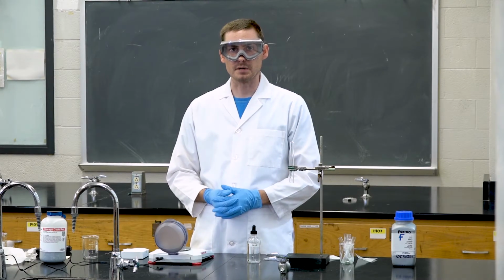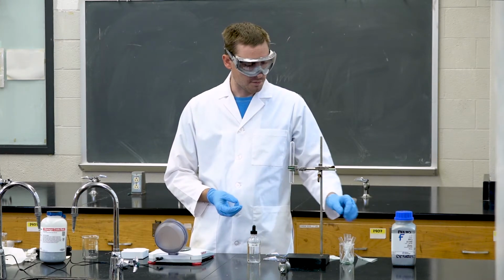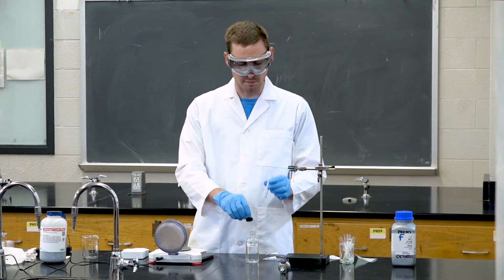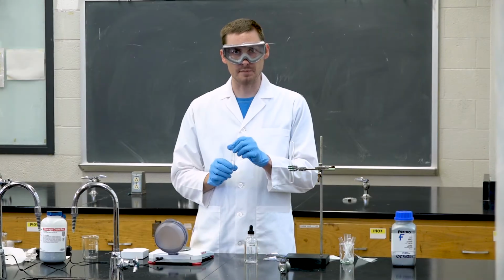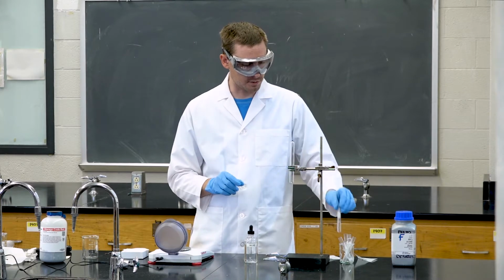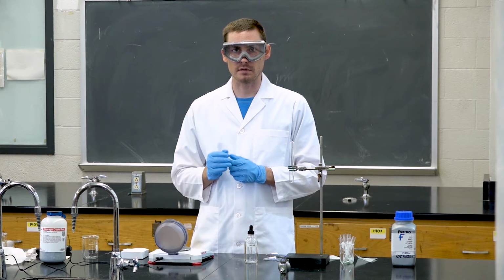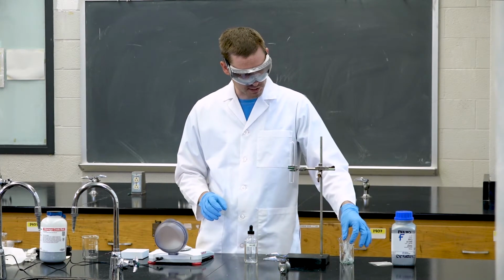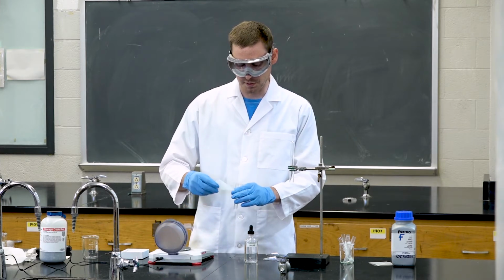So after we perform the experiment with zinc, we're going to repeat the experiment with calcium, but we're going to use less calcium this time. First, we want to add 5 milliliters of 6 molar hydrochloric acid to a test tube again. After we have measured out the hydrochloric acid into a test tube, we can then weigh out 0.1 to 0.2 grams of calcium metal on the balance. Record this number in your lab book and then carefully slide the metal into your test tube and watch the reaction take place.